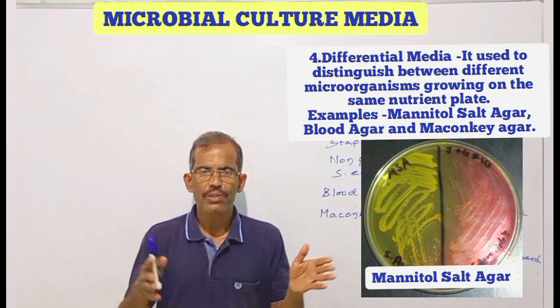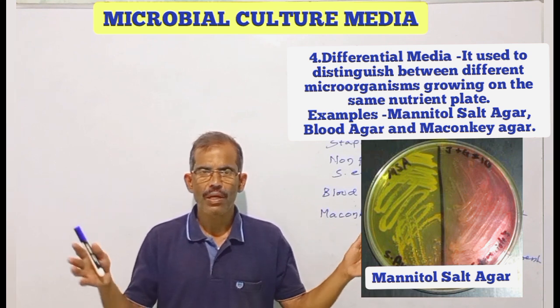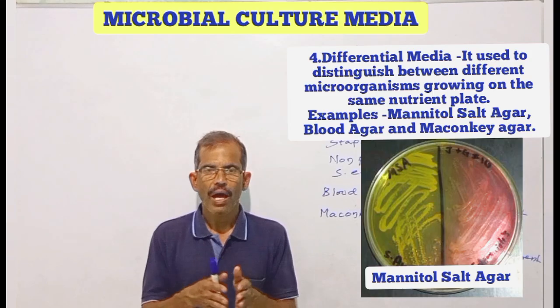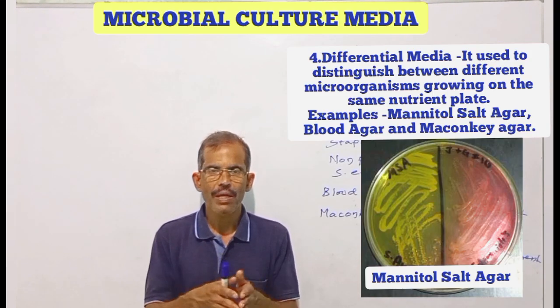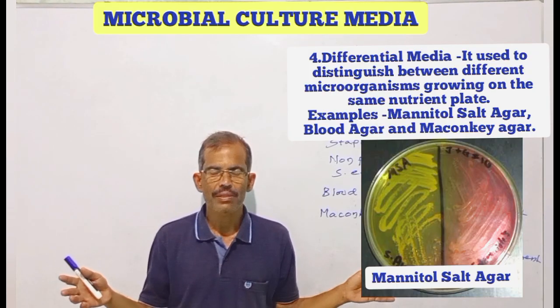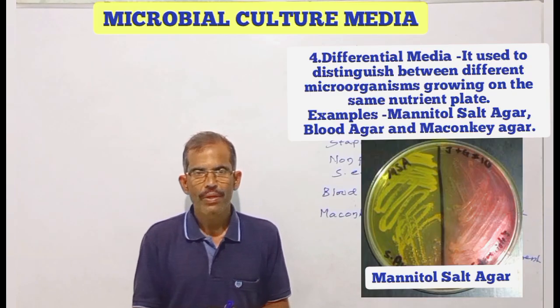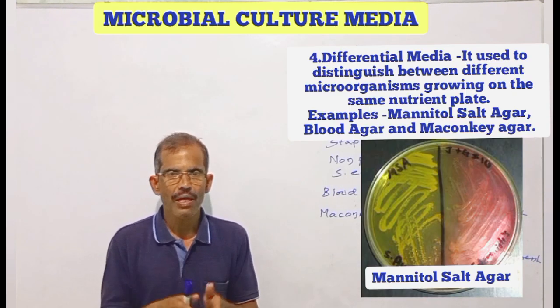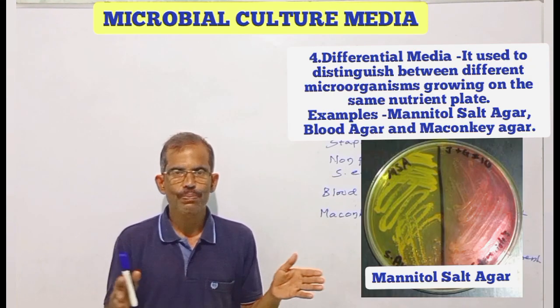This medium is used to distinguish between lactose-utilizing and non-lactose-utilizing microbial colonies. When grown in such type of media, lactose-utilizing microorganisms consume lactose and break it down into acidic byproducts that make the target bacterial colonies red. On the other hand, those microorganisms that fail to utilize lactose have colonies that remain colorless or transparent.